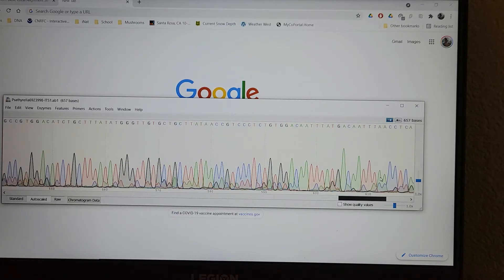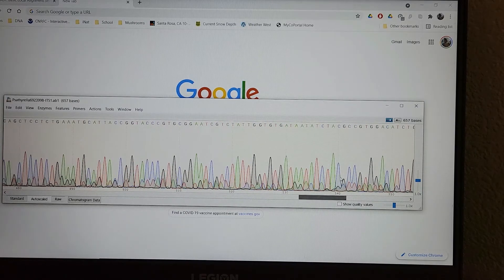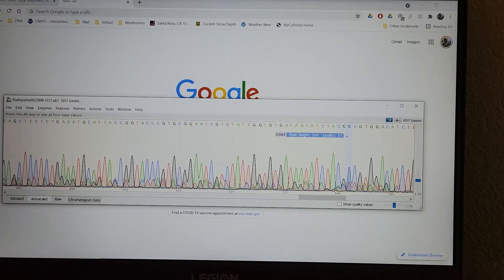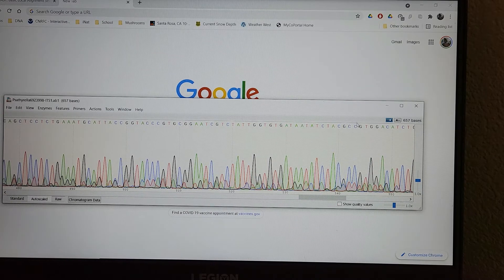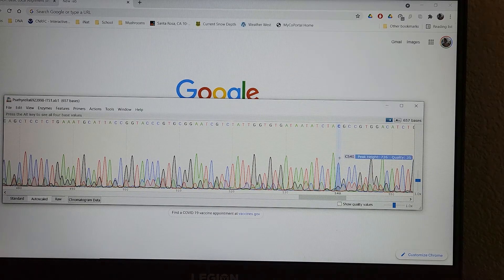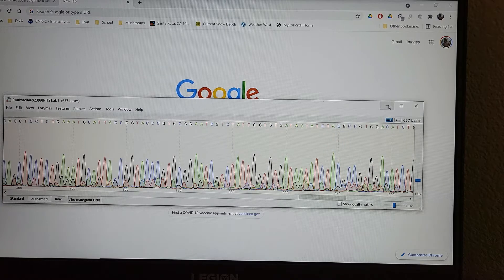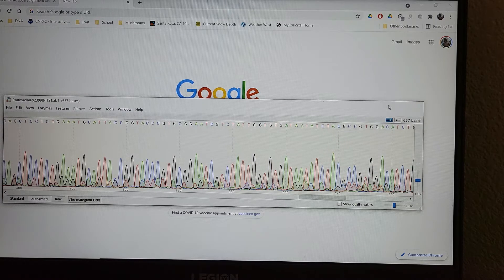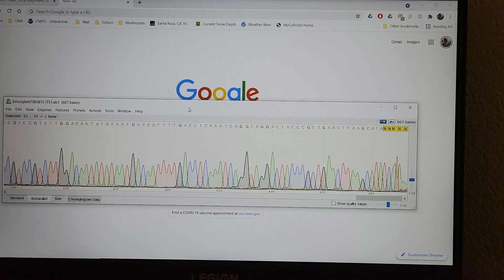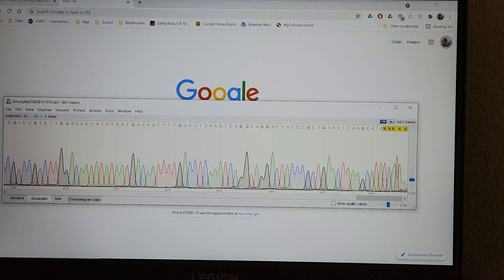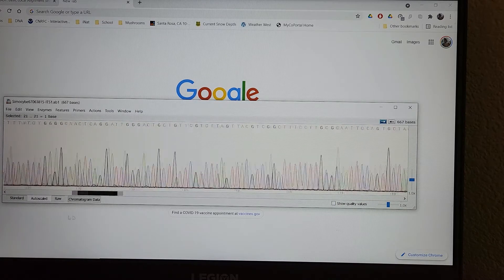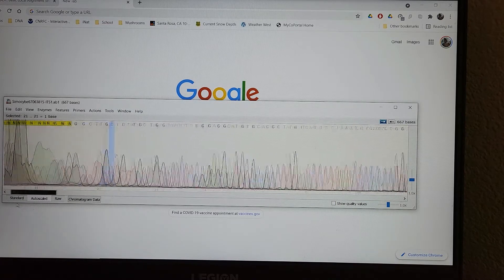This is an example of kind of a crappy sequence. You might be able to get good data off of it, but it's not going to be ideal. And of course, there's some that are far worse than this. Definitely not the worst sequence I've seen. So how do we analyze this data? So now that we've just looked at the sequence, we see it looks good.